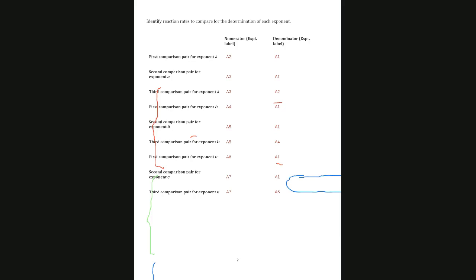And you should actually make sure that this is true. I did it because I wasn't happy. I'm like, okay, is this true? But yes, you will notice that when you divide A4 by A1, you can calculate the coefficient B. This is all given.